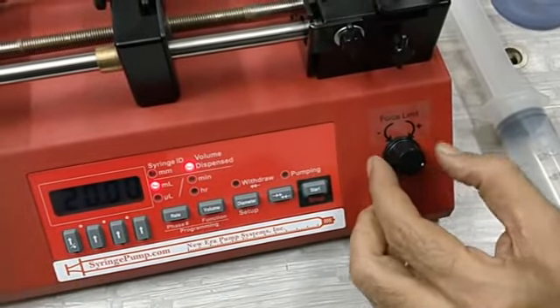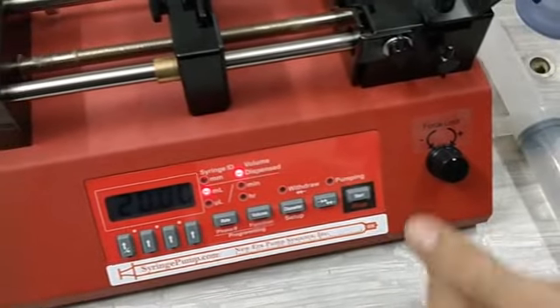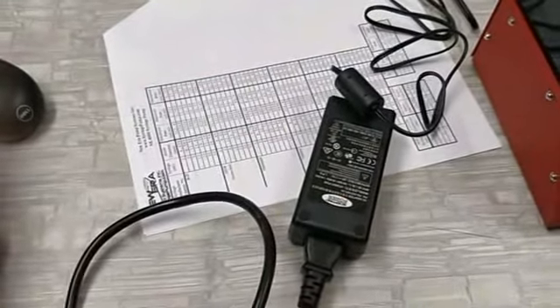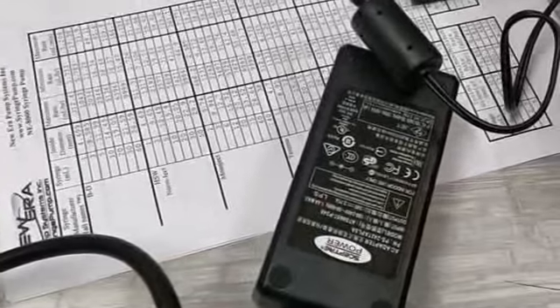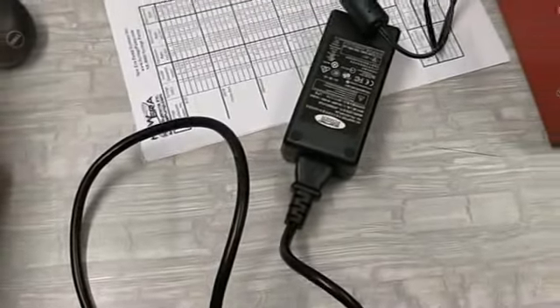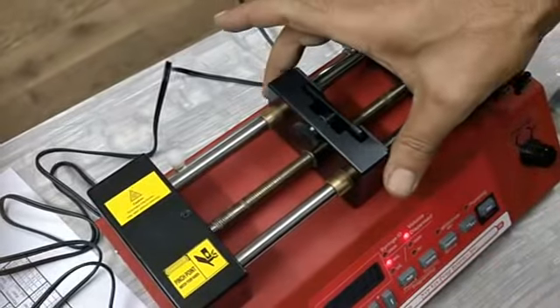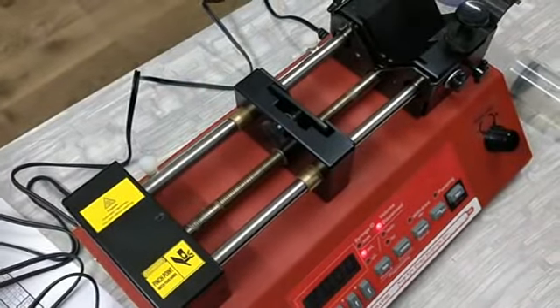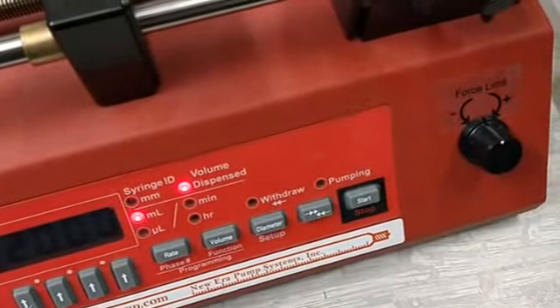So if you are using a very viscous solution, you can increase the force. Normally I would keep it in the middle. The second difference is that the NE-1000 models operate on 12 volts DC, but because this is a high force pump it takes more power and operates at 24 volts DC. The third difference is that in the NE-1000 series there was one drive nut on the pusher block, and after pressing it you could move the pusher block back and forth manually. But in this one, you will have to move the pusher block using the pulse function only, which we will discuss very soon.